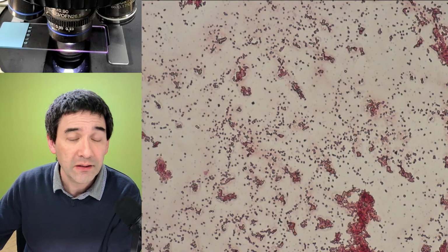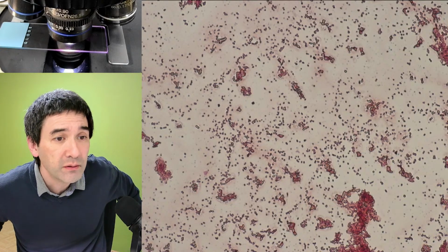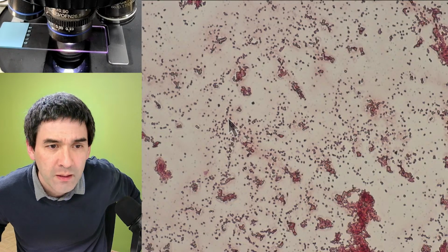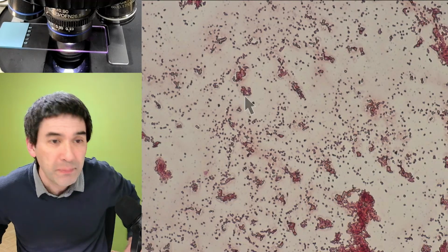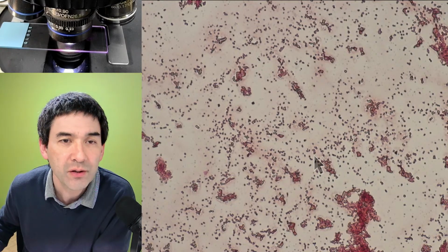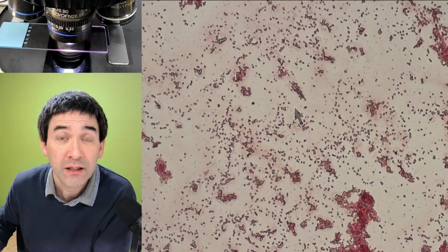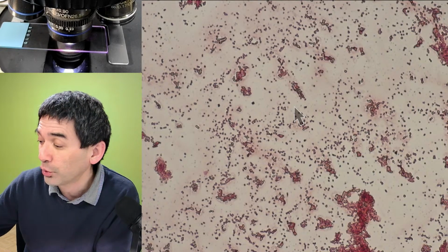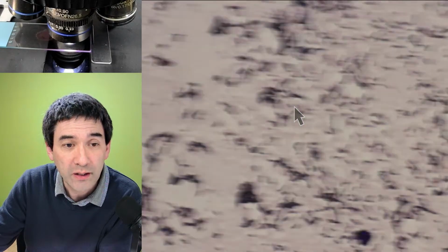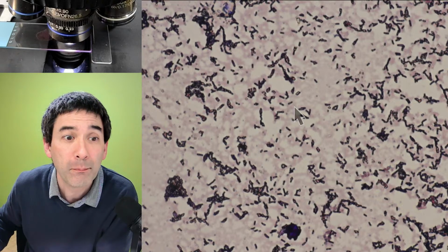Okay, what you see over here is bacteria, and let me quickly, do I have an arrow somewhere? Here it is, the arrow. So all of these dots that you see here are bacteria, and you see that they are stained red. So these are so-called Gram-negative bacteria because they are staining red. And I'm now going to also show you bacteria that stain Gram-positive. I'm moving this over. Look, these bacteria here look much darker and they stain Gram-positive.